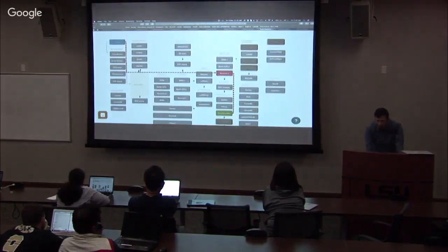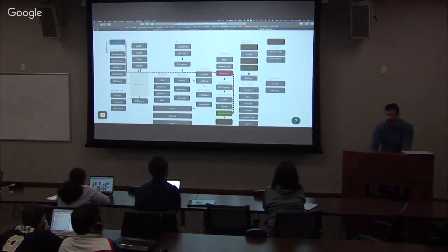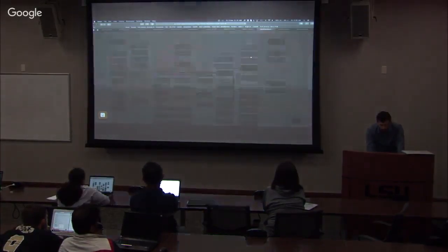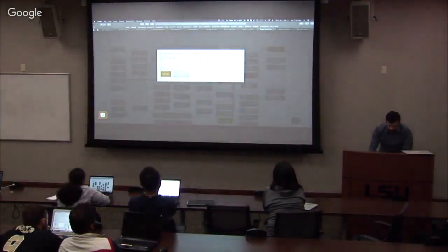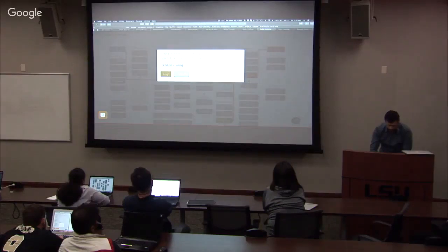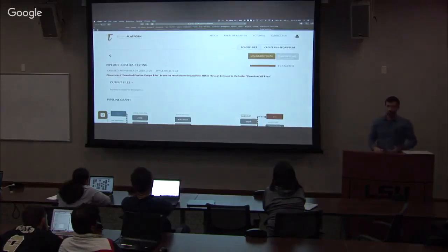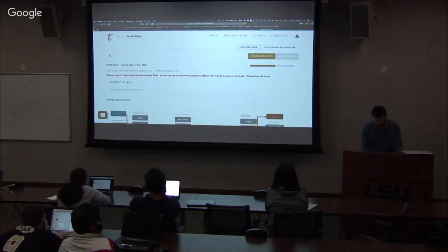And now I have this option to do differential gene expression. So I can choose between edgeR, DESeq, and DESeq2. If I was using the cuffmerge, cufflinks, etc., I would be able to use cuffdiff. So let's, for example, do DESeq2, and you can read about it right here. And end. What would be the output of these different files? And by the way, you can use edgeR, and then you can compare what's the difference.